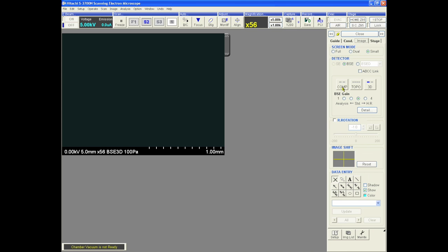VPSC gain changes the electronic amplifier for the signal. 2 or 3 is normal for low magnification, and 4 is used for high magnification.